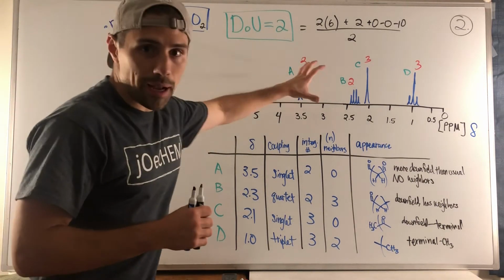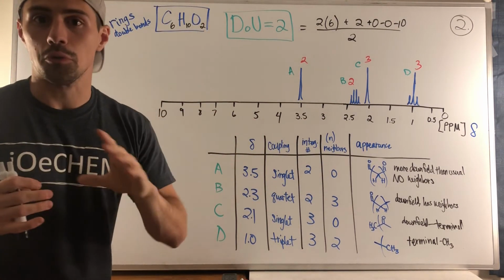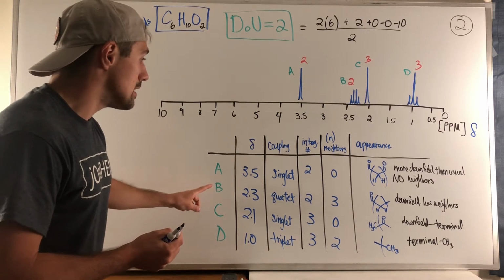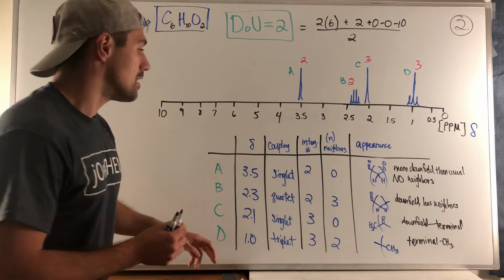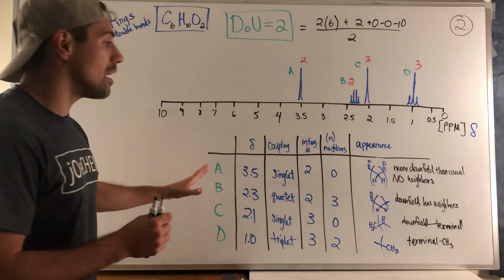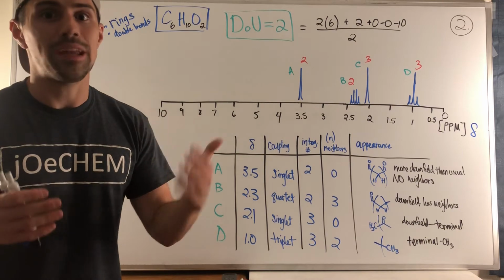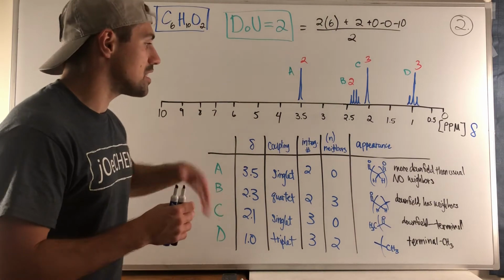So in taking a look at our spectrum and completing step 2, which is populate our chart, I think it's very easy to rule out rings being part of our degrees of unsaturation because of 2 signals in particular. That would be both B, sorry, not B. It would be both A and D. Sorry. Oh my goodness. I'm so sorry. It is both A and C because they end up having no neighbors. They're singlets, right? If you think about a ring, there would be more symmetry if we had a ring and some other degrees of unsaturation. So I think it's safe to say that we have a couple of double bonds here.